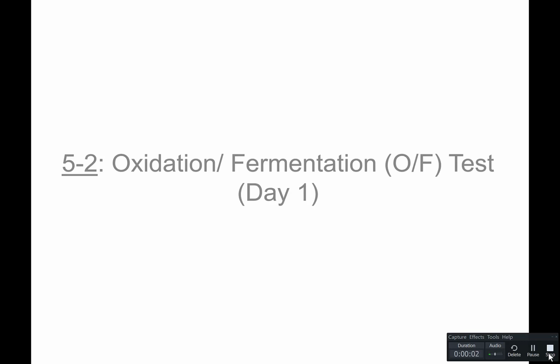So in this video, we are going to cover the oxidation fermentation, or what we call the OF test. And this is activity 5-2. The first part of this will cover day 1, meaning the setup of this experiment. And then the second part of the video is going to cover day 2, looking at the readout for this experiment. And so let's talk about this experiment.